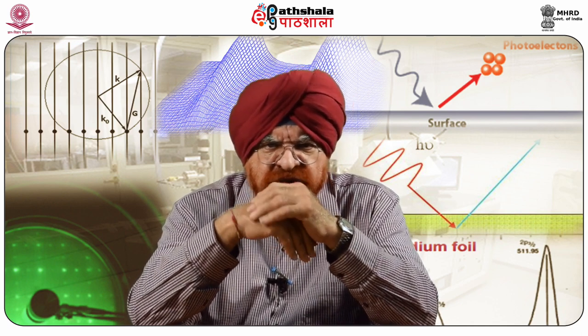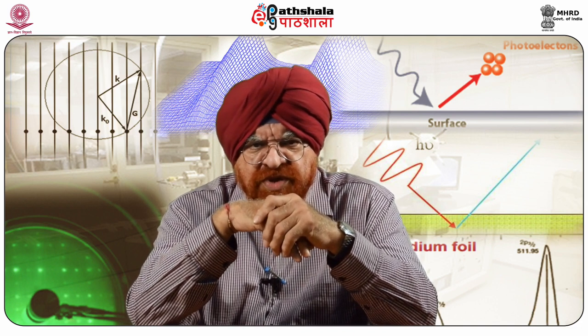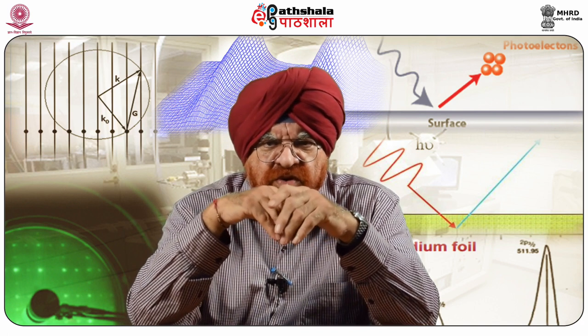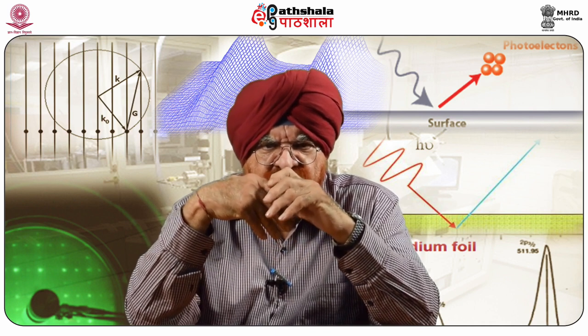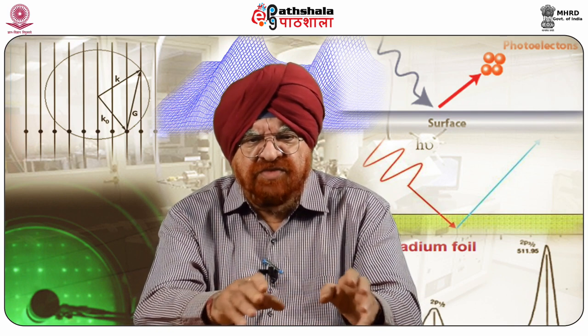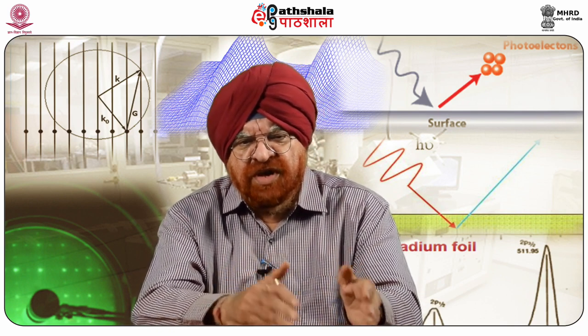When you look at the instrumentation, a typical XPS spectrum is a plot of the number of electrons detected versus the binding energy of the electrons detected. Each element produces a characteristic set of XPS peaks. These characteristic spectral peaks correspond to the electron configuration of the electrons within the atom, for example, 1s, 2s, 2p, 3s, etc.